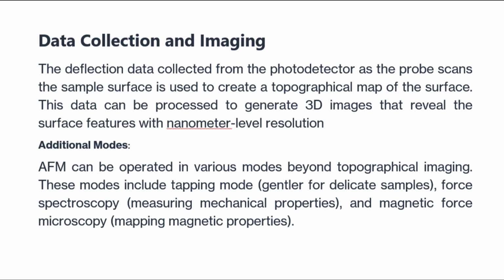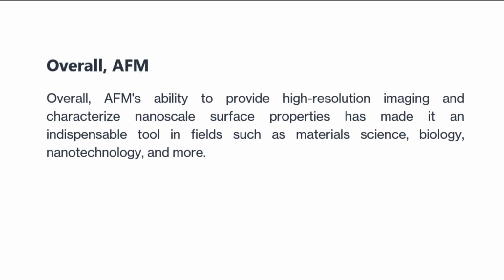These modes include tapping mode, gentler for delicate samples, force spectroscopy, measuring mechanical properties, and magnetic force microscopy, mapping magnetic properties. Overall, AFM's ability to provide high-resolution imaging and characterize nanoscale surface properties has made it an indispensable tool in fields such as materials science, biology, nanotechnology, and more.